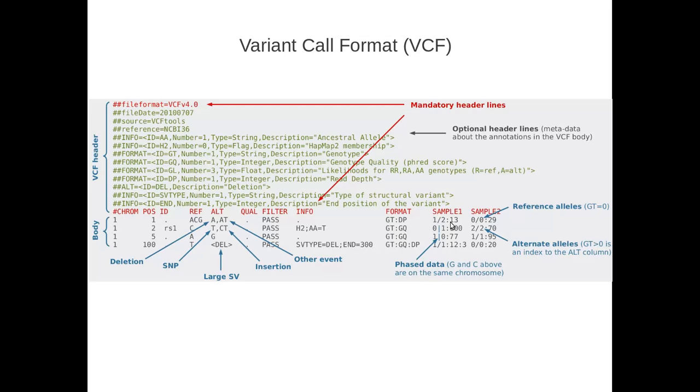Okay, so I'll also mention that we encounter what we call variant-only VCFs. These are VCF files that only have variable sites in them. We also can store all of the information from a data set, including invariant sites. So you can store the entire genome from a sequencing project. However, one of the main reasons to do resequencing is to get the variable sites, and people are less often interested in the invariant sites.